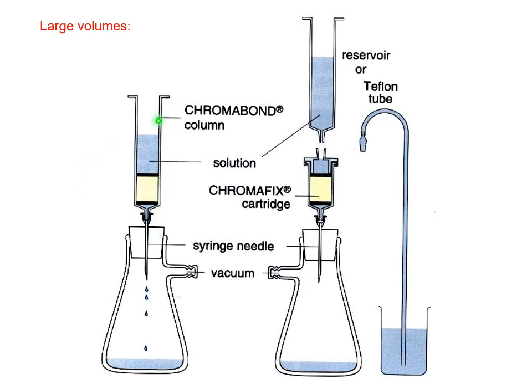One more alternative, simply applying vacuum filtration, exactly like we did for usual filtration. Sometimes you need additional pressure here so you can wash your solution through the usual filtration flask. Again, applying vacuum here.